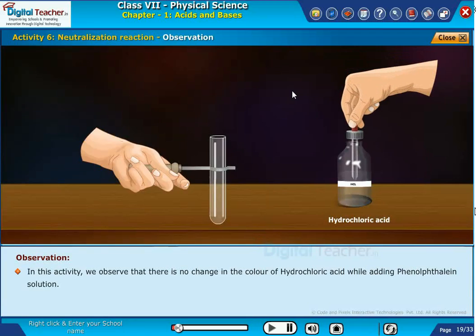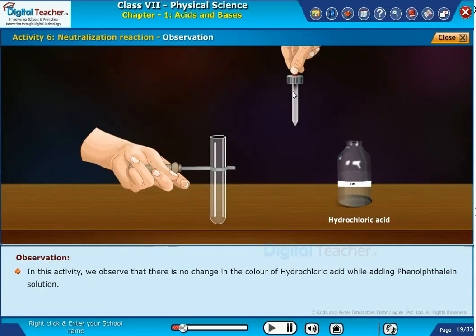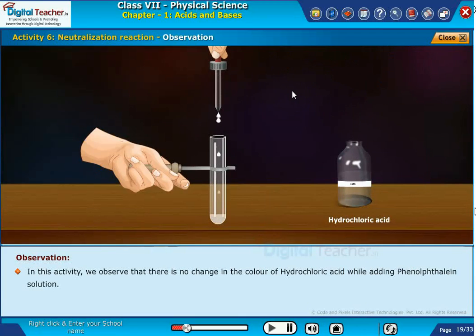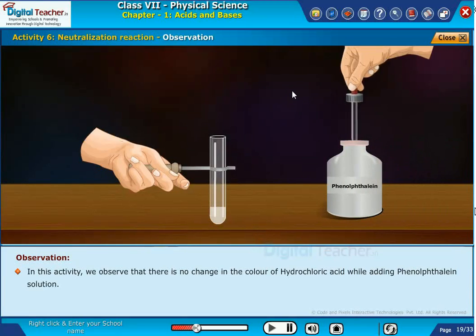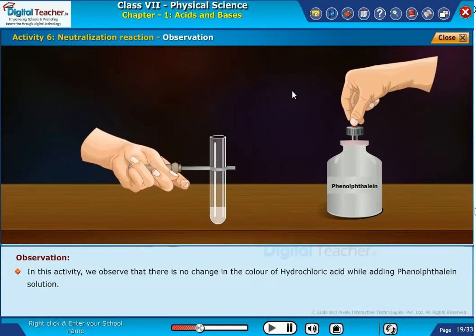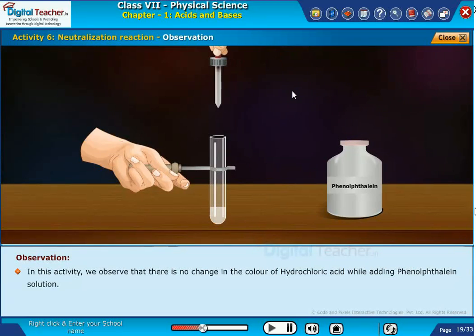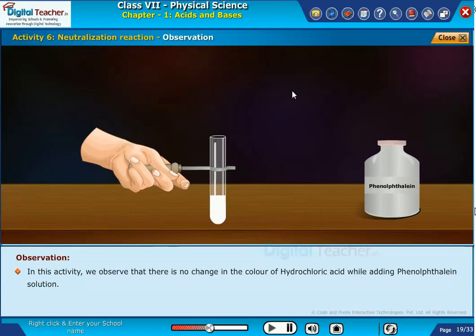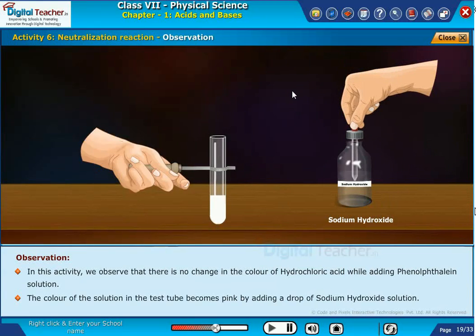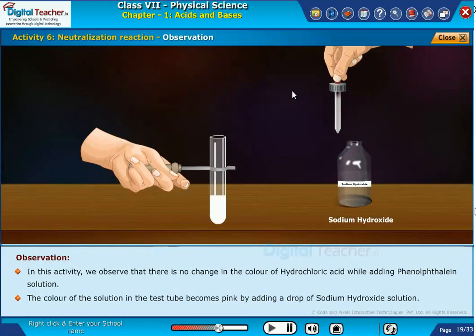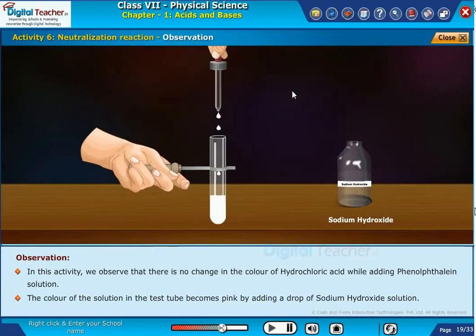In this activity, we observe that there is no change in the color of hydrochloric acid while adding phenolphthalein solution. The color of the solution in the test tube becomes pink by adding a drop of sodium hydroxide solution.